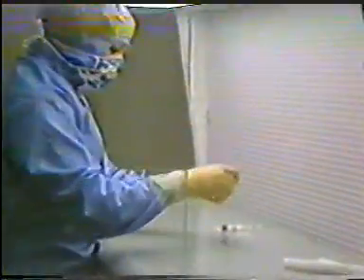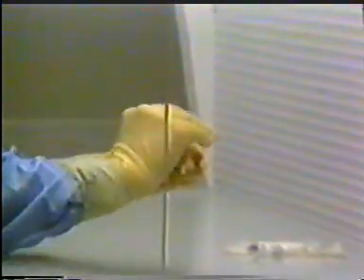Aseptic technique is used when the final product cannot be heat sterilized. Solutions are made as far as possible from sterile components and are sterilized by filtration before being packed into pre-sterilized containers.